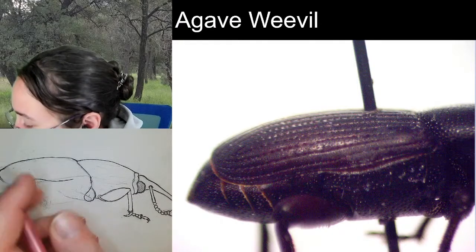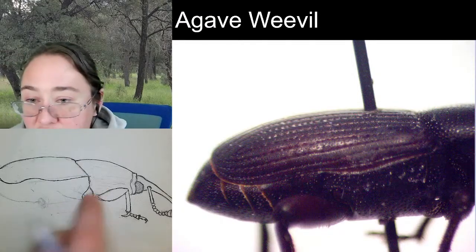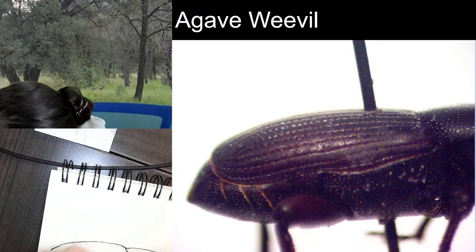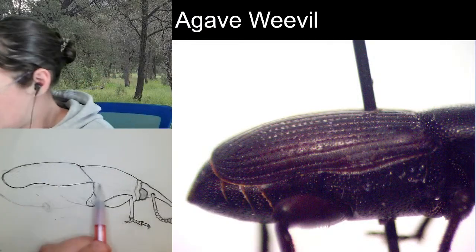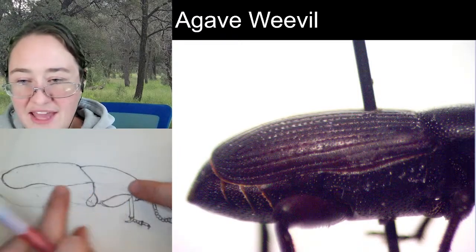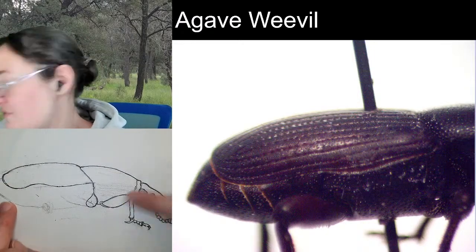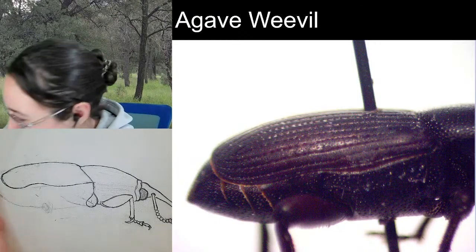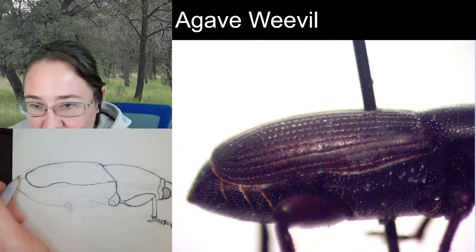And you want to make sure that it still is going to be meeting right there where the angle of the pronotum hits. Because that is where the edge, kind of like the top of the body is. There's kind of like an edge right here on the beetle. This is the closest point to us, and then everything else is kind of curved underneath, I guess is what I'm trying to say. So from here, we've got this abdomen happening.